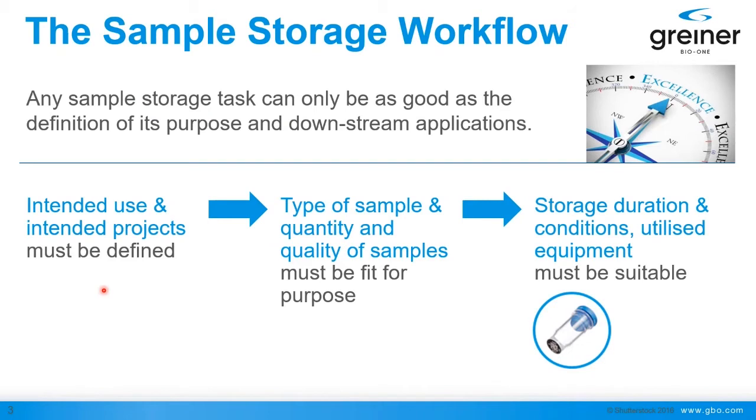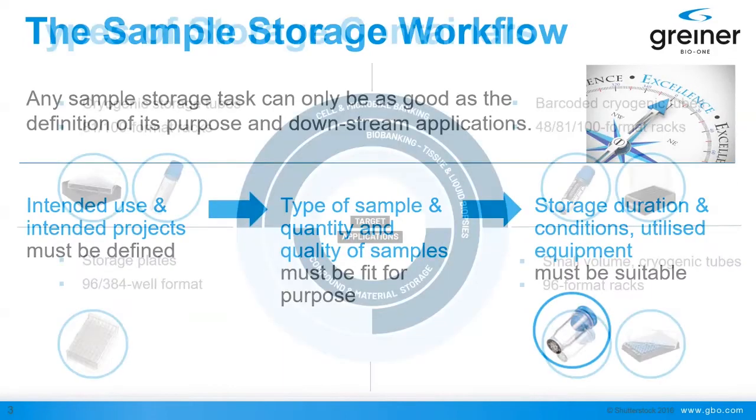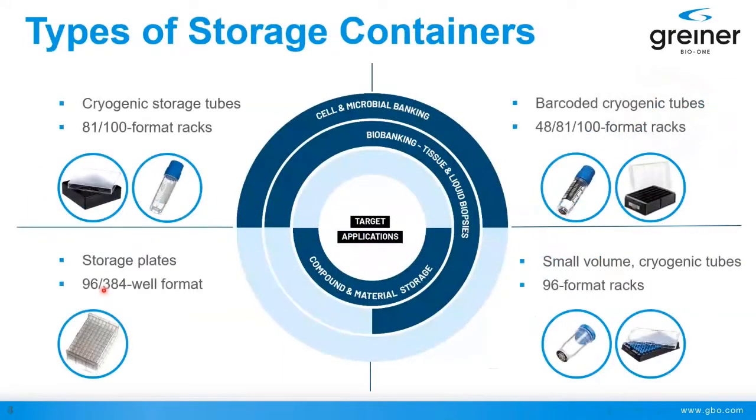And if all this has been clarified, then we finally come to the last group of items that need to be fixed, and these are actually your storage containers, your storage equipment, equipment you use for processing, but also other characteristics of your project, such as which temperature do you want to store it, and also for which duration in time do you want to carry out storage.